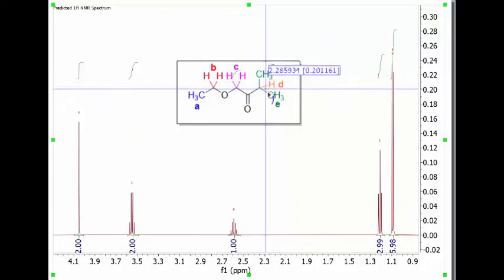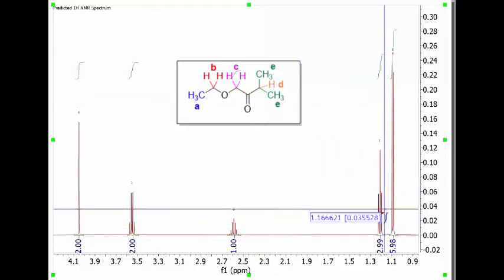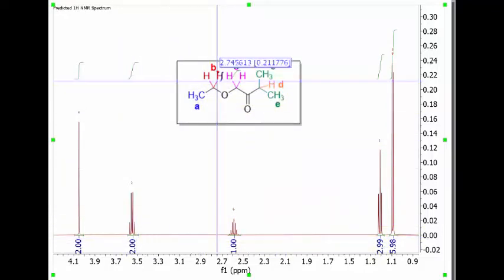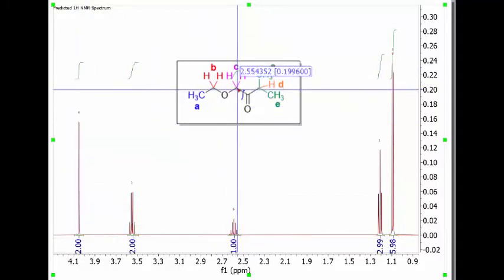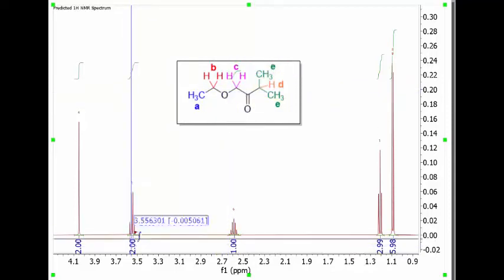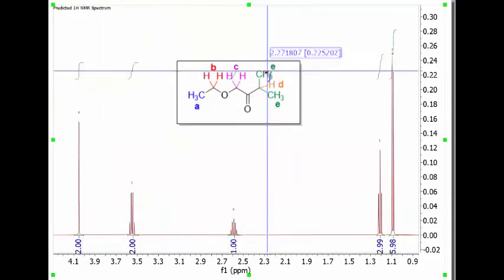And then this right here is a doublet worth 6, so it's clearly the green. And then here we have a triplet worth 3, this guy, and then a quartet worth 2, a complicated peak worth 2 is B, and then this guy right over here is the singlet and furthest left peak because he's between the two. Now, as it turns out, they predicted more like 3.5 rather than 4, and it turns out they predicted more like 4 rather than 4.5 or 5.